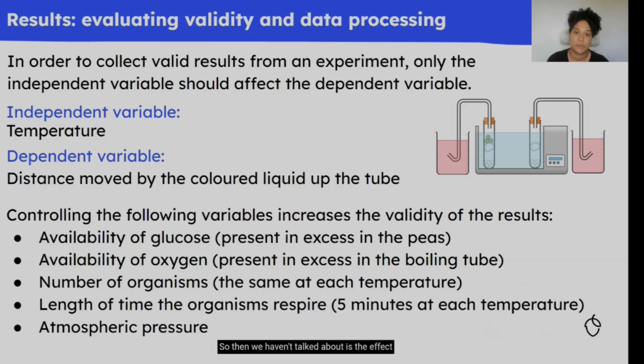Something we haven't talked about is the effect of atmospheric pressure on this practical, and that's why we have two tubes set up, tube A and tube B. So now I'm going to explain the purpose of tube B and what that's got to do with atmospheric pressure.